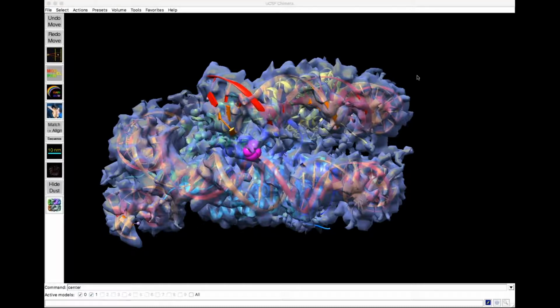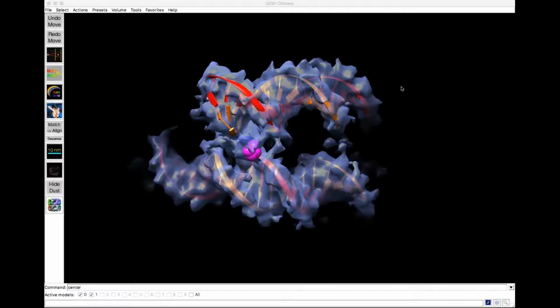And then this camera side view can be really nice for getting better images. Maybe now it's hard to see that N-terminal residue, but if we clip in, maybe it's a little bit easier to understand what's going on, and this might be a nicer way to make a figure for your papers. This isn't quite as necessary for the nucleosome. It's a pretty small structure, but when you're dealing with the 50S or the 60S ribosome that Dario was showing you, it's a really big volume, and maybe clipping in will help you see better. And that's our next thing, is to open those.